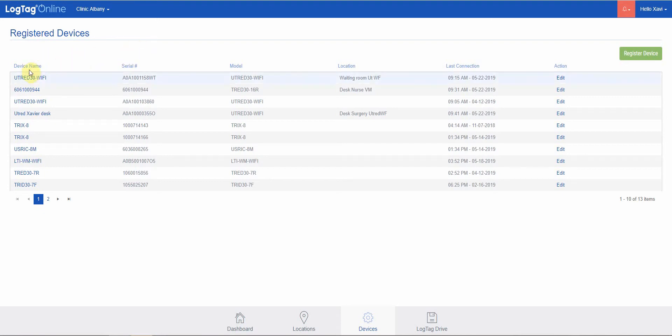Within this page, we see a list of devices that have been registered to your account or ones that you've received information from, whether you have files from that logger or have it available to be linked to a location.